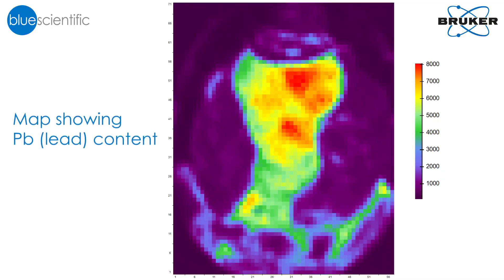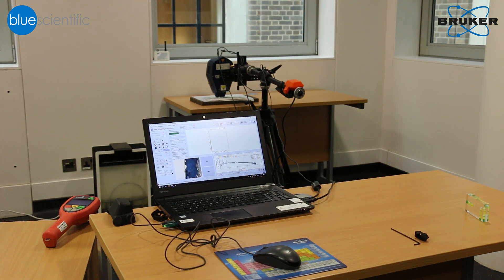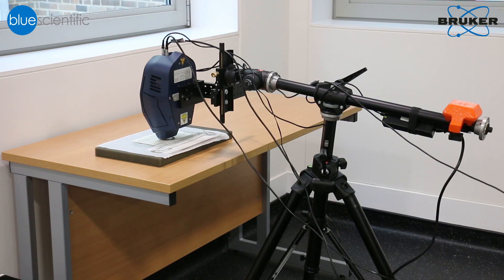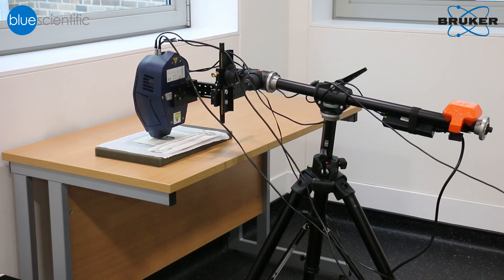Elemental maps are also a great tool for outreach and dissemination of results, because images are a great way to communicate even very complex scientific information. The fact that the ELU is a portable instrument is really key in our case. Despite working at the Fitzwilliam Museum today, a lot of miniature collections are actually spread out across country houses, national trust properties, and small private collections — places where it wouldn't be feasible to transport heavy machinery or large pieces of equipment. It's not always appropriate for the miniatures to travel to a laboratory space either.